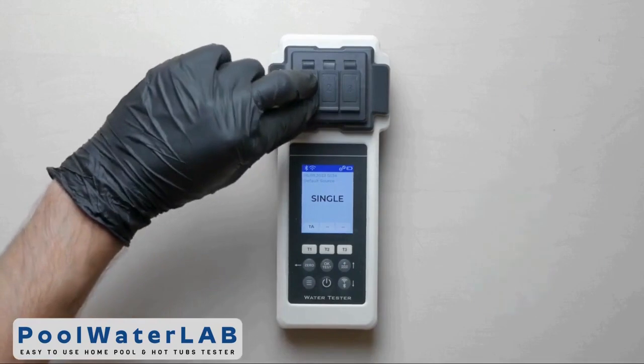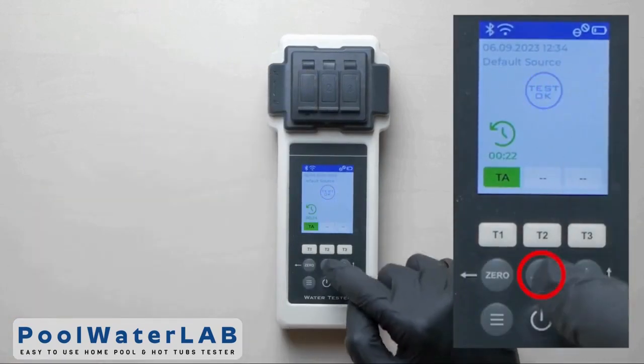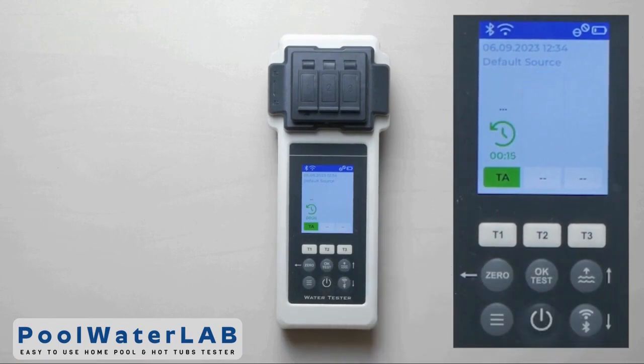Cover the chamber with the light protection cap and press the one button to start the countdown. Press the OK button and wait until the countdown ends and the test results appear.